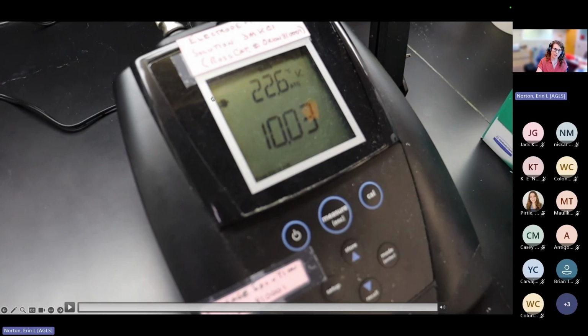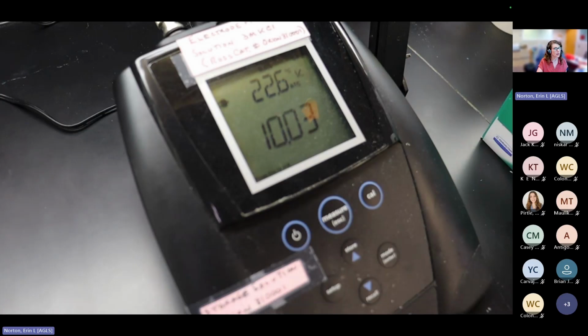Typically, what we want to do is see our slope, and we want our slope to be between 97 and 103. That's our range of allowance for that calibration, and that just means that your pH meter is reading accurately.